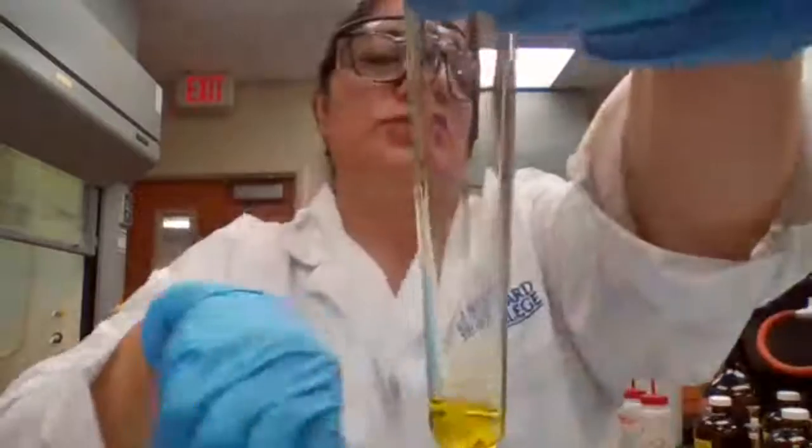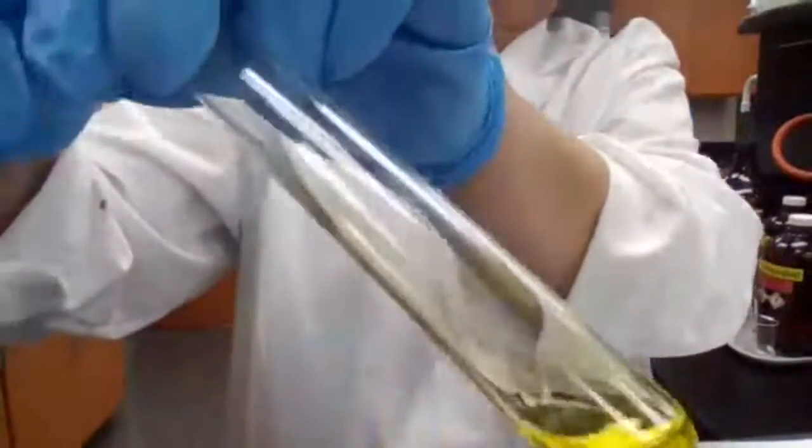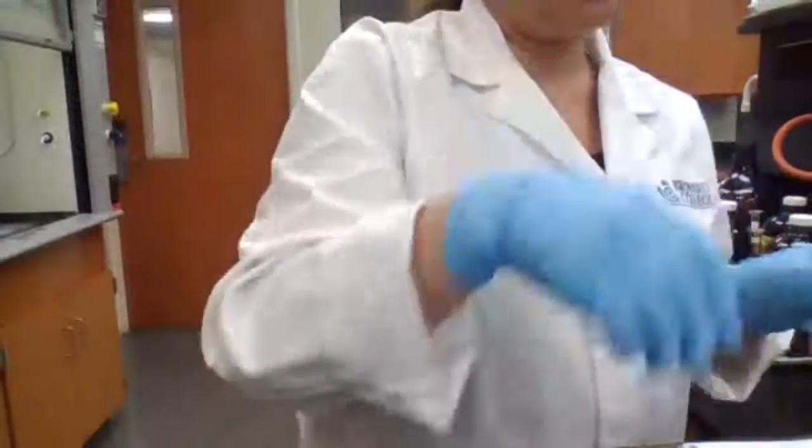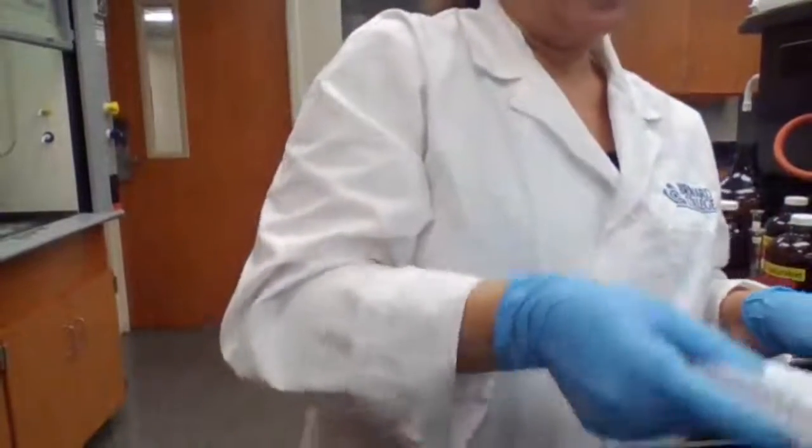I'm trying to get you the best angle, so the color in the camera shows as the color that I have here. Okay, you can record the color. This is just the potassium chromate.